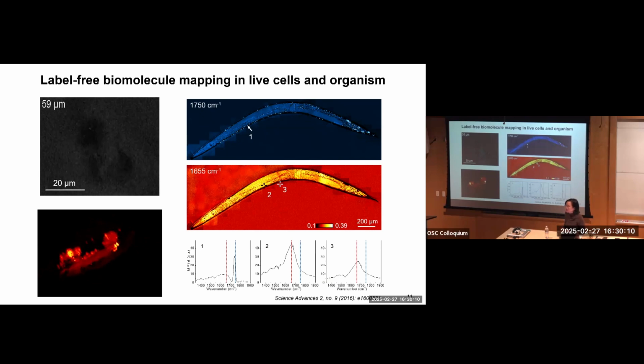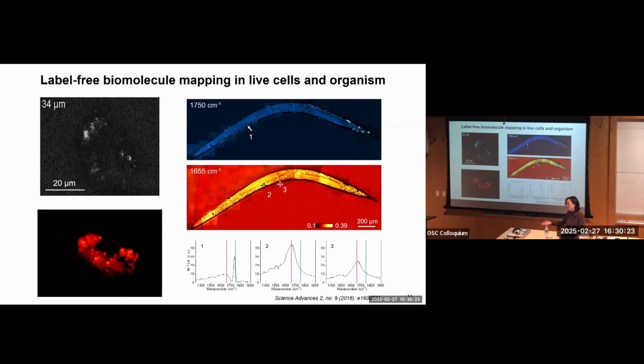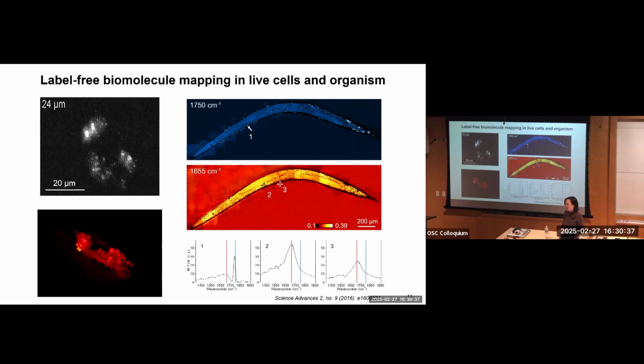But for a change of a few degrees Kelvin, the change in refractive index cannot be that great. Actually, the relation is 10 to the -4. If you increase the temperature by 10 degrees, then it will be 10 to the -3. We can detect that. If you think about detecting Raman scattering, where the scattering cross section is 10 to the -8, people can still extract that. But for us, we are detecting 10 to the -3, so we can detect that.